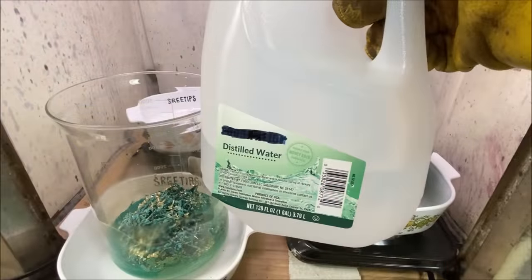And I'm gonna reach down in here and get a little bit of this solution on a piece of filter paper. We're gonna test this with stannous chloride, just verify that we've got gold in solution. There you see it, that dark stain means we've got plenty of gold in solution. I'm gonna add a few ice cubes to cool the solution down a little bit.